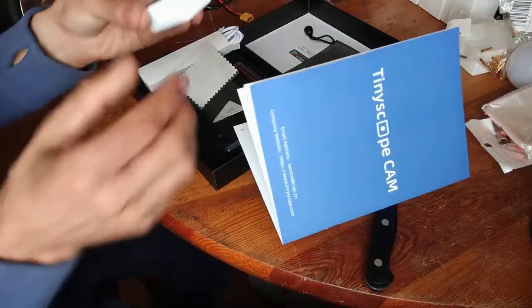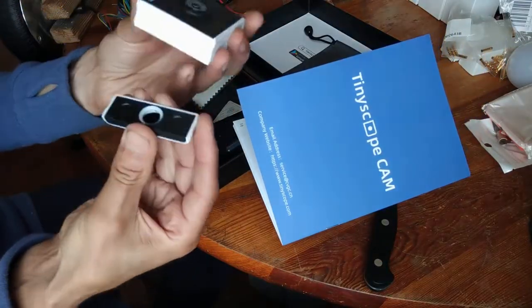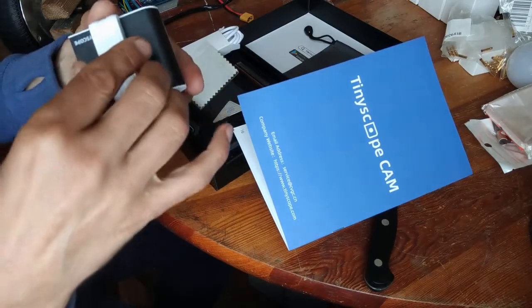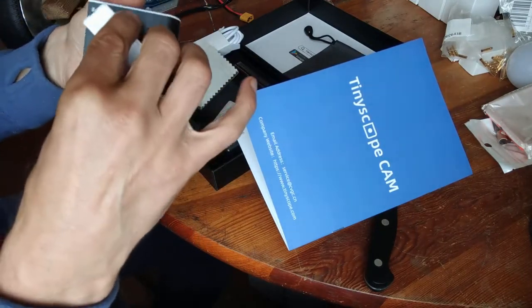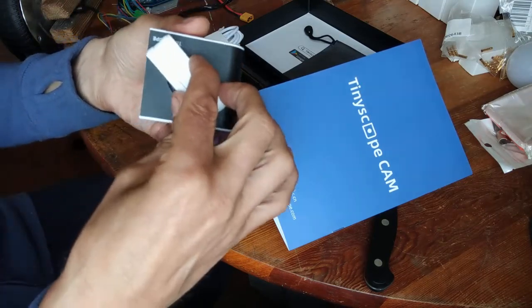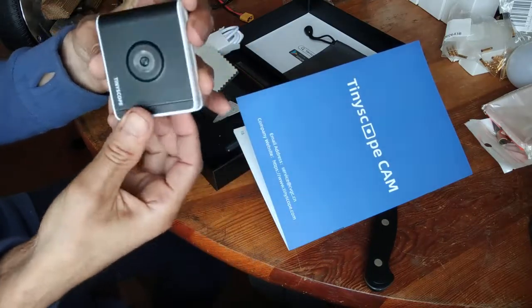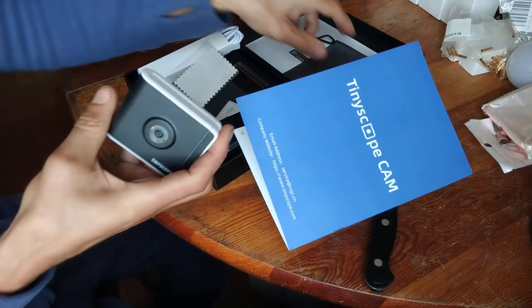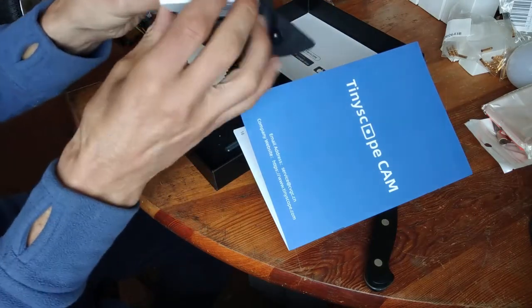Oh, that's cool — it's magnetic! You can put this piece on top and it automatically snaps into place with the magnets. That's really nice — it means you won't lose the cover. It just jumps right into place and keeps everything secure in your pocket.